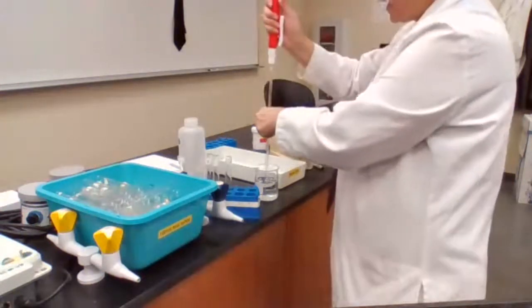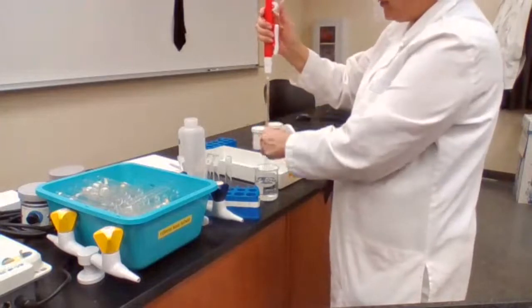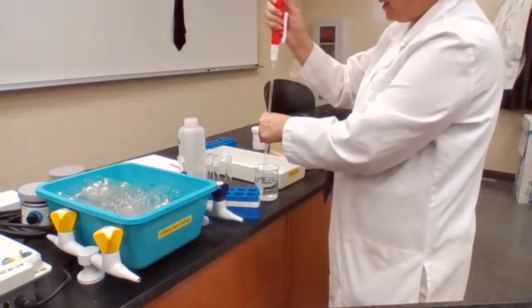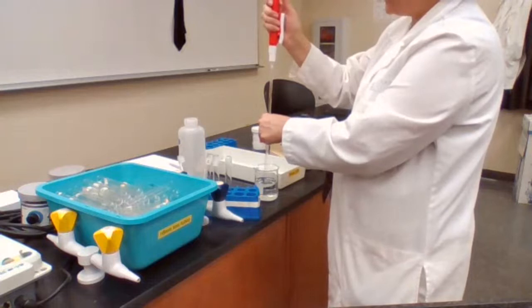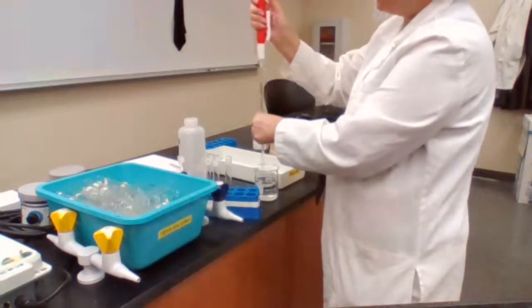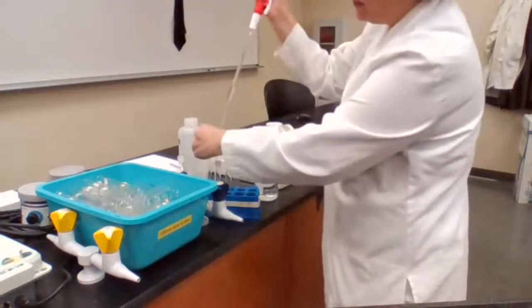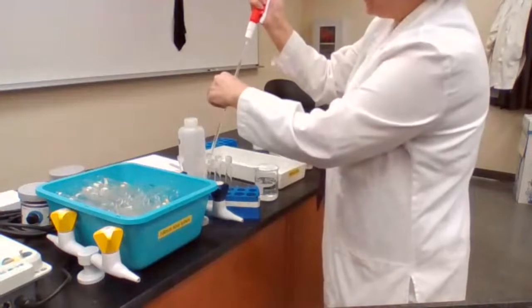I place the tip inside the water. It cannot touch the bottom of the beaker. It cannot be on top, because if it's on top, it's going to pull air. Adjust the meniscus and get the 5 milliliters. Next test tube.